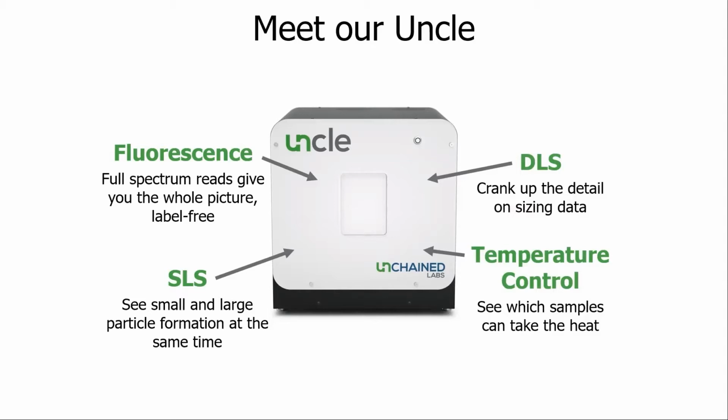SLS is static light scattering. That's going to be the intensity of the light from the UV and blue lasers that bounces out of the samples. Because that laser is hitting particles and bouncing back out, SLS is a really great method to look at when particle formation is occurring in a sample. We'll check out some of the advantages of SLS versus other techniques during this talk.